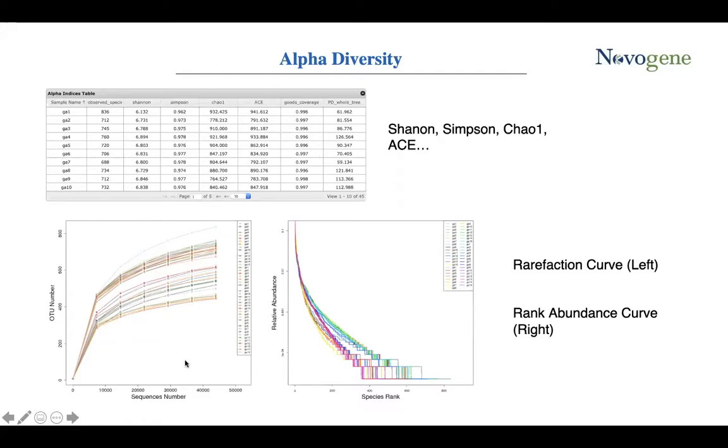The rarefaction curve is created by randomly selecting a certain amount of sequencing data from the samples, then counting the number of the species it represents. In the rarefaction curves, each curve here represents a sample and can be colored and shaped by each sample name supplied in the mapping file. The sequence number is on the x-axis, and the observed OTU number is on the y-axis.